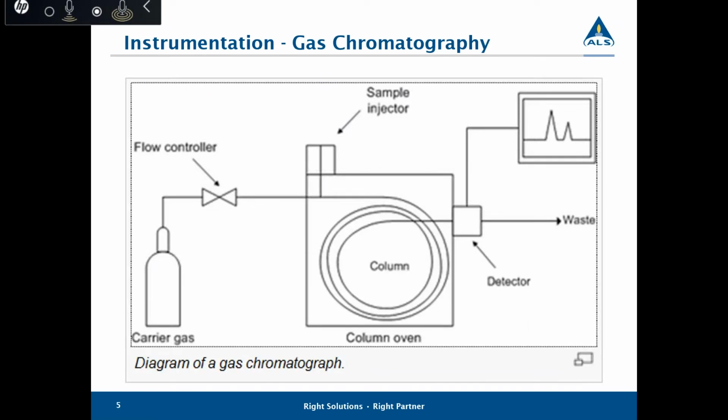The lab generates results using gas chromatography. It's a method of separating components of a mixture so they can be measured, or as we call it, detected. A usual gas chromatograph consists of an oven, a long thin glass column which contains the material that binds to components of the sample, an injection system, a detector, and a carrier gas.